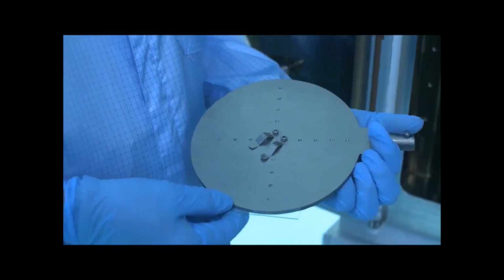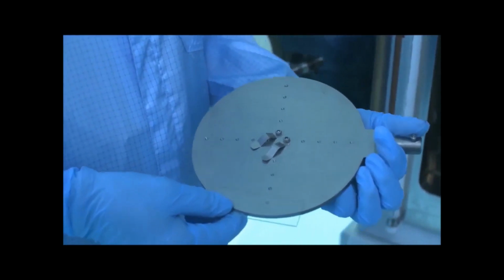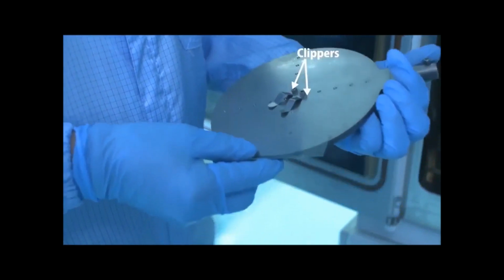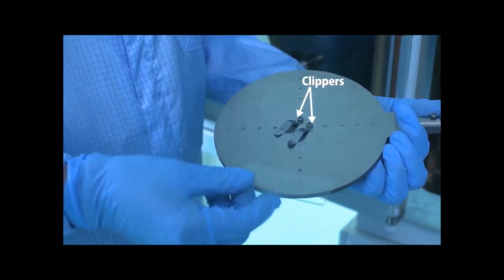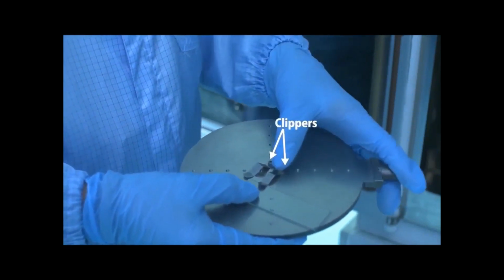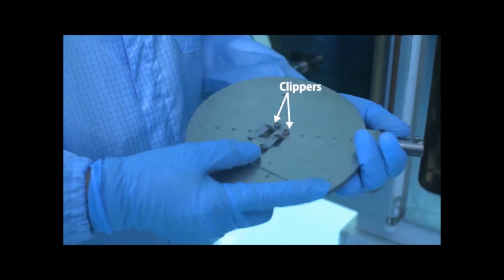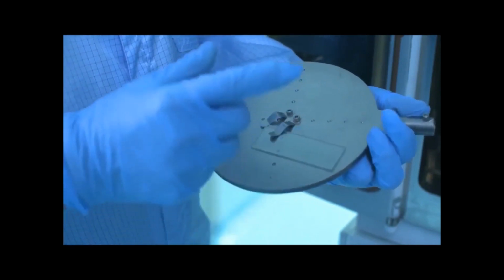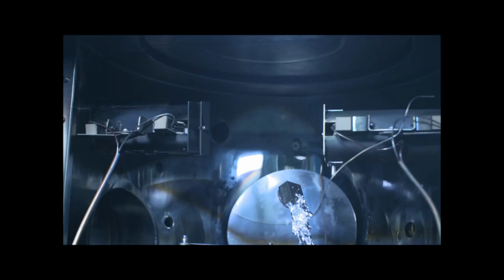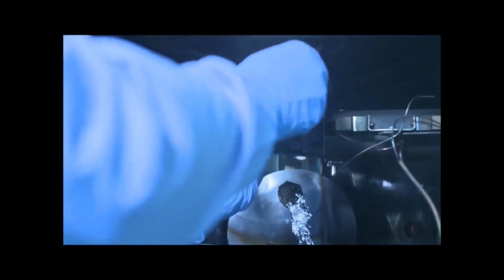As we have understood the different components and parts of our deposition system, let's start the deposition. First, let's put this substrate over the substrate holder. There are clips which can hold the substrate. We can put a substrate of any shape and size in this clip, and after that we have to mount the sample holder in our system.